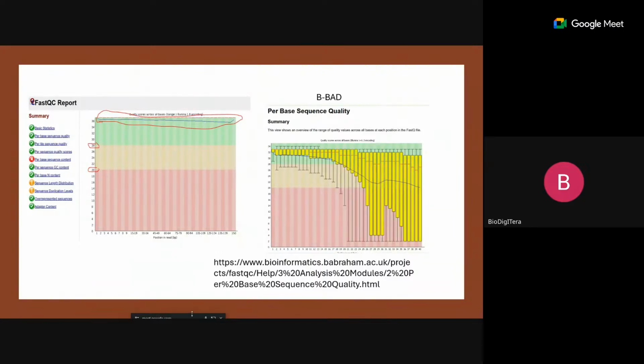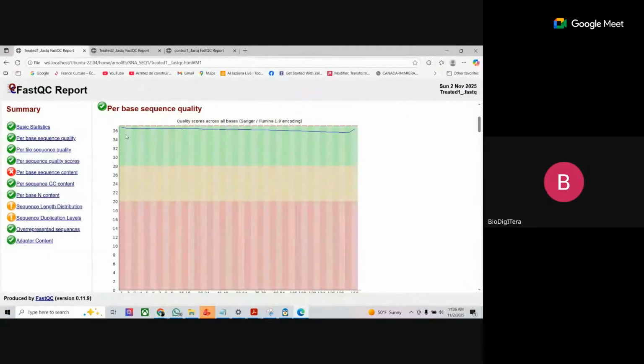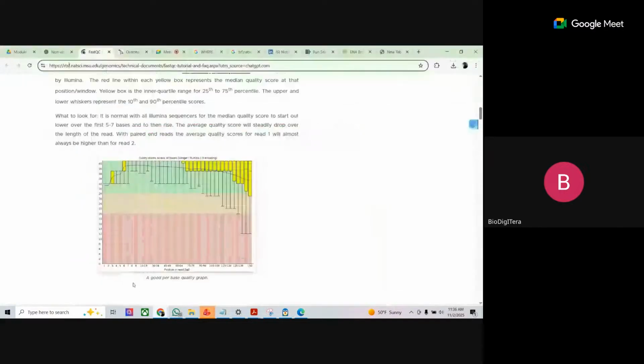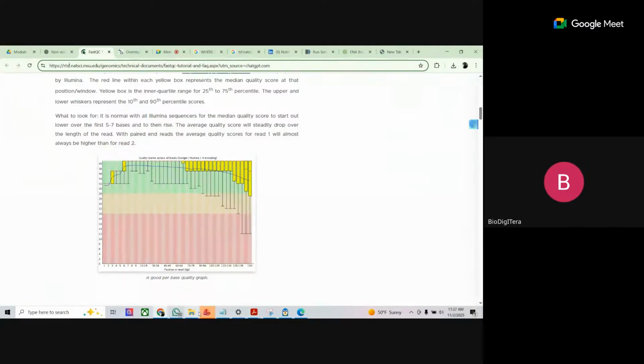Just see, I show you before I come here. This one is clean. Do you agree with me? This one is clean. But if we go here, this one is not really, they are really very different. See this blue line. Look at it well. You are seeing the yellow spot. If you see both, let's now go in the PowerPoint.